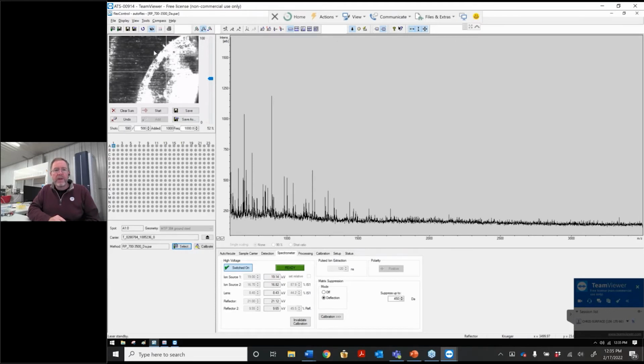And in this window here, we have a camera within the MALDI system that actually is taking a look at that well, and we can navigate within that well just by clicking at different locations. What you see here is the dried matrix analyte that has been deposited on the target, and we have loaded a method here that allows us to accumulate data in the reflectron positive mode.